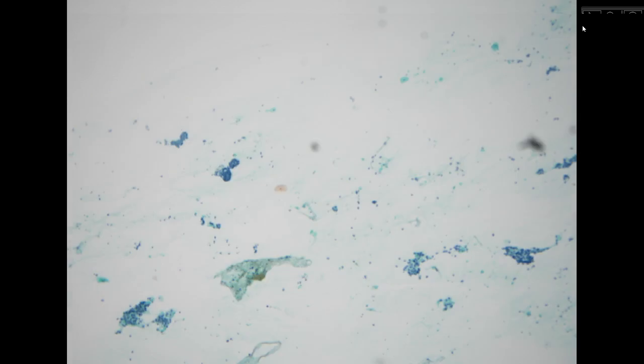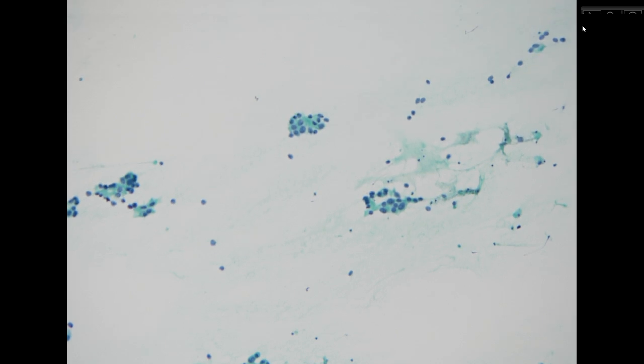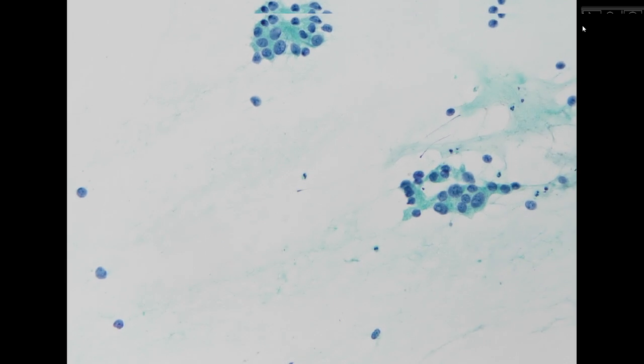So the final case is also coming from the pancreas. This is a direct smear. In this specimen, the liquid-based cytology is very overlapping, so not easy to see. But if we have a very nicely prepared direct smear, it's actually very easy for the diagnosis.